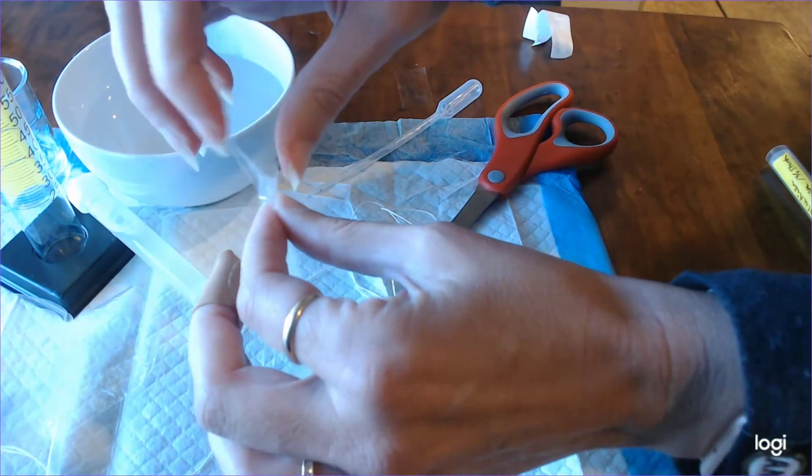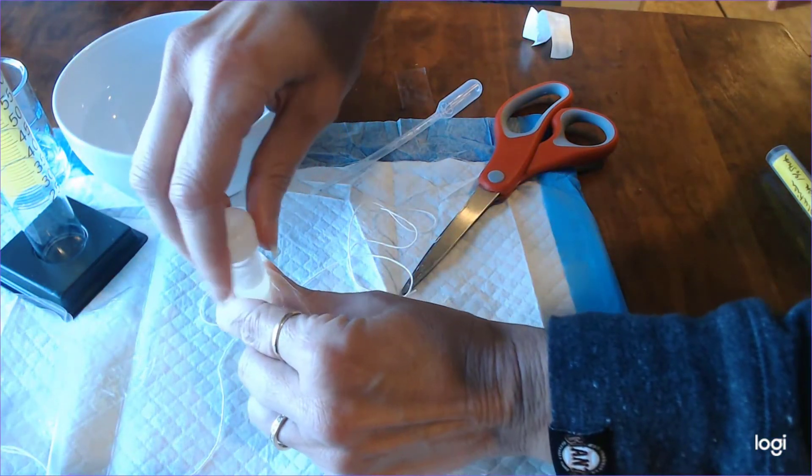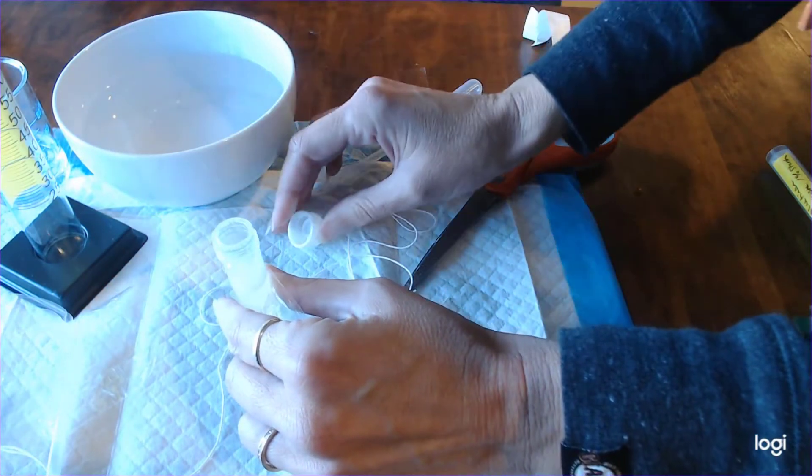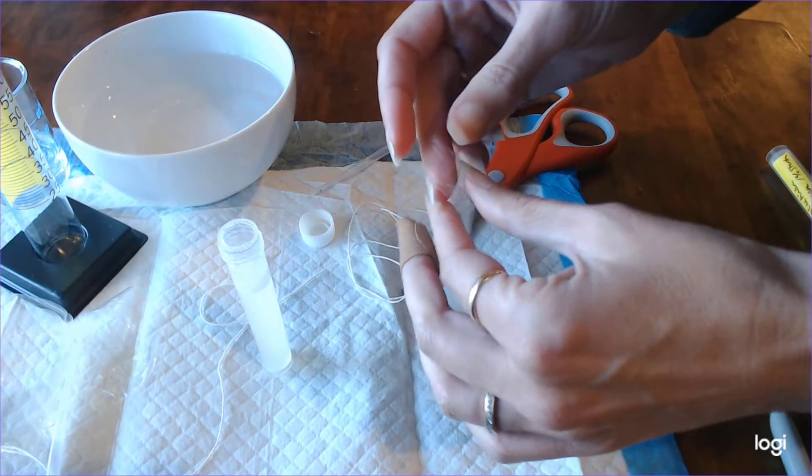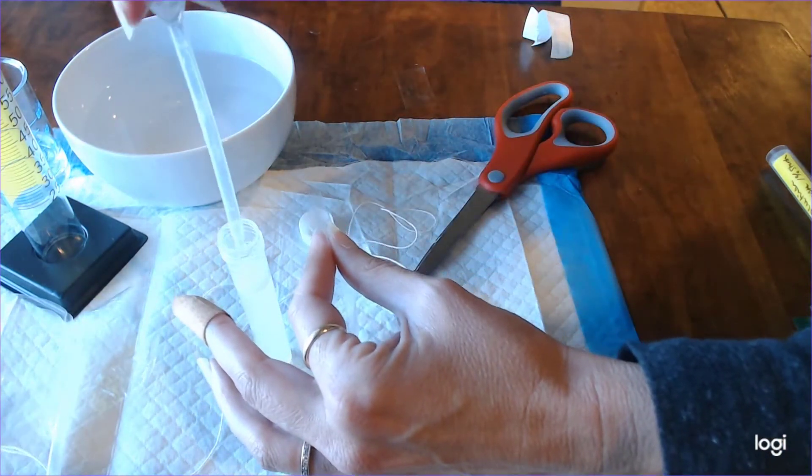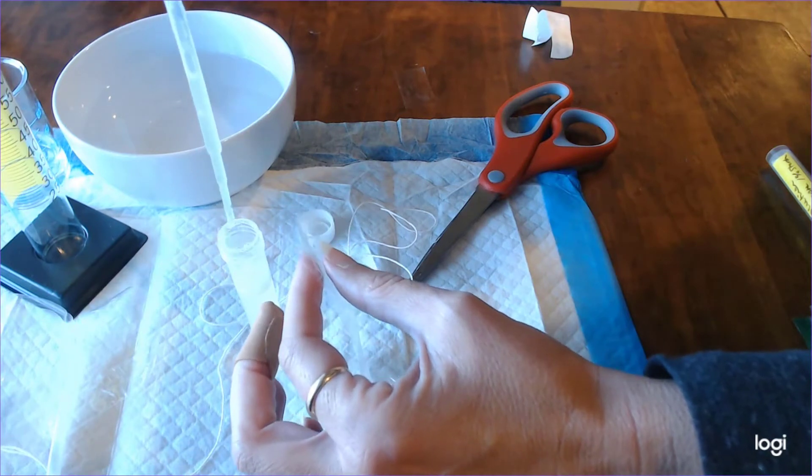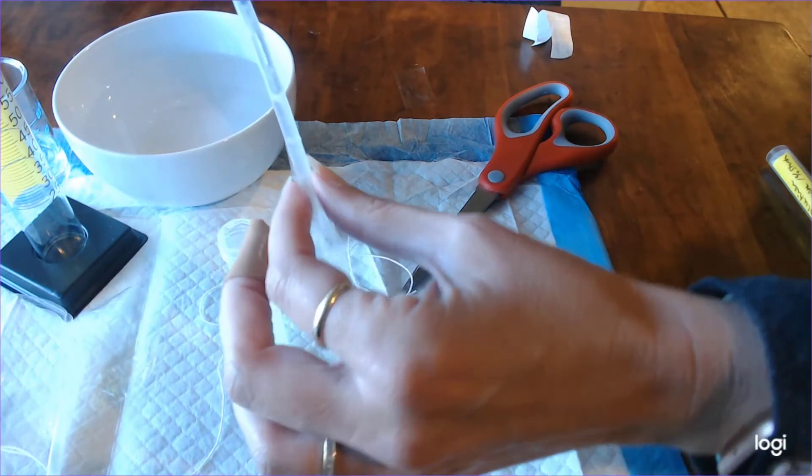Now we're going to go ahead and add our dialysis solution that has been dissolved into the dialysis tubing. Now that tube is a little precarious so what I recommend doing so that you don't knock it over like I almost did a couple different times is actually put it in the 50 milliliter beaker so that it gives it some stability or a small cup so that you don't do that.